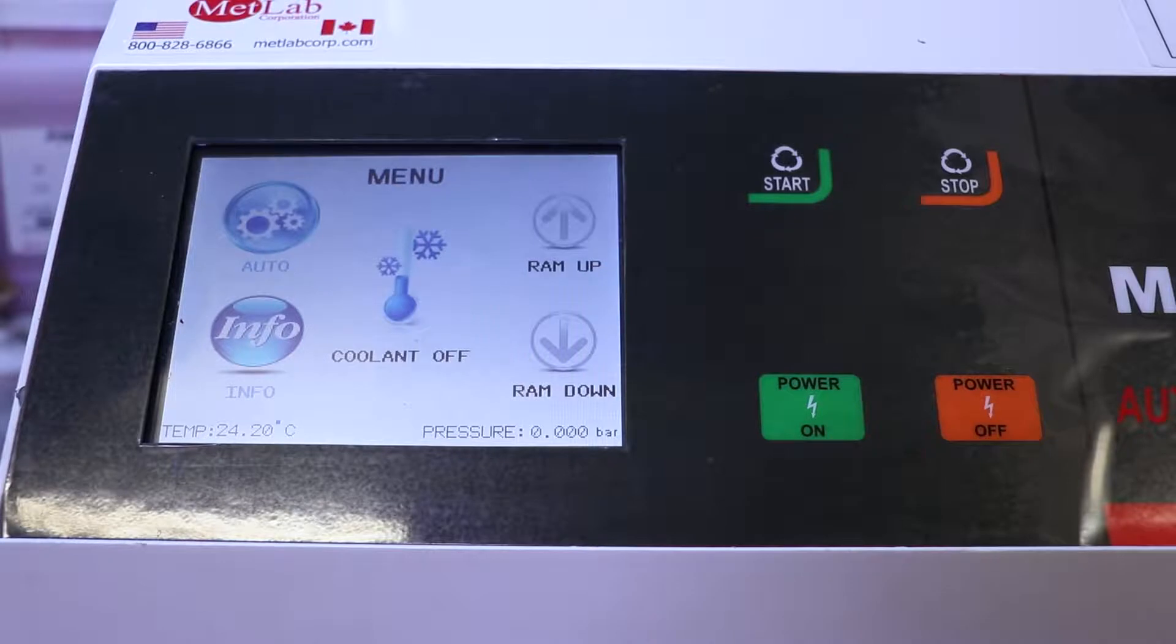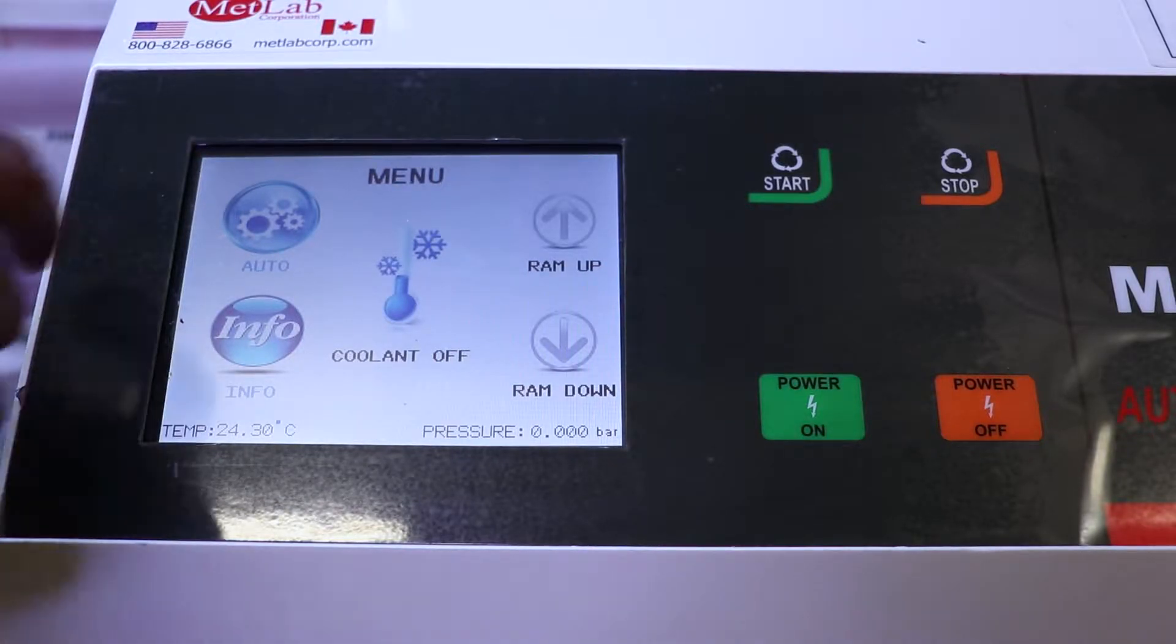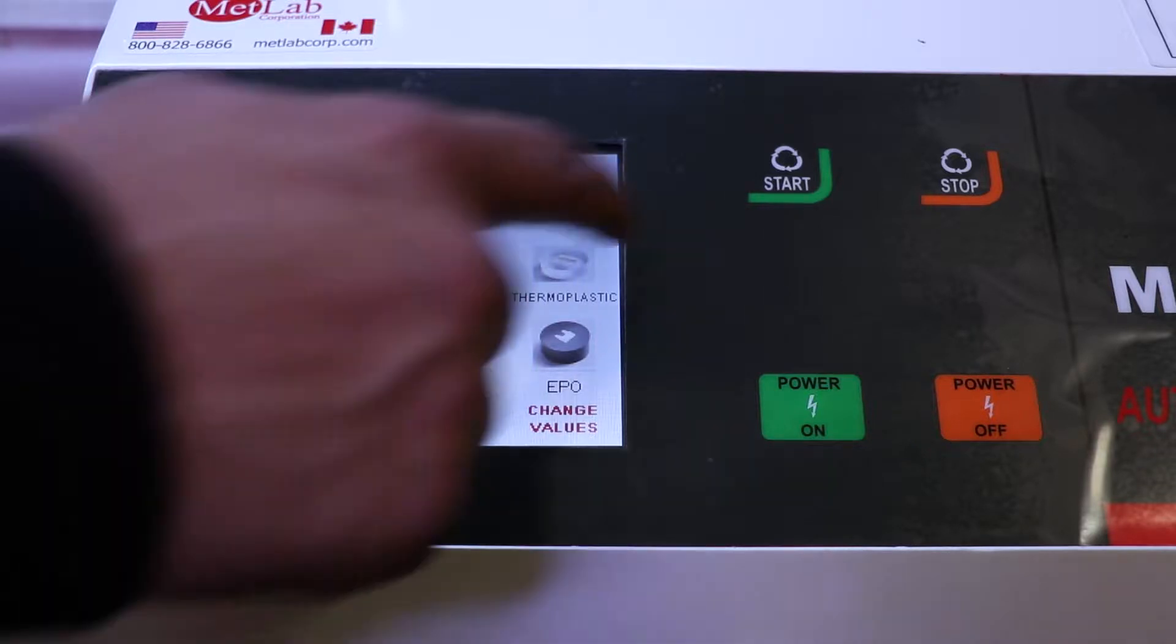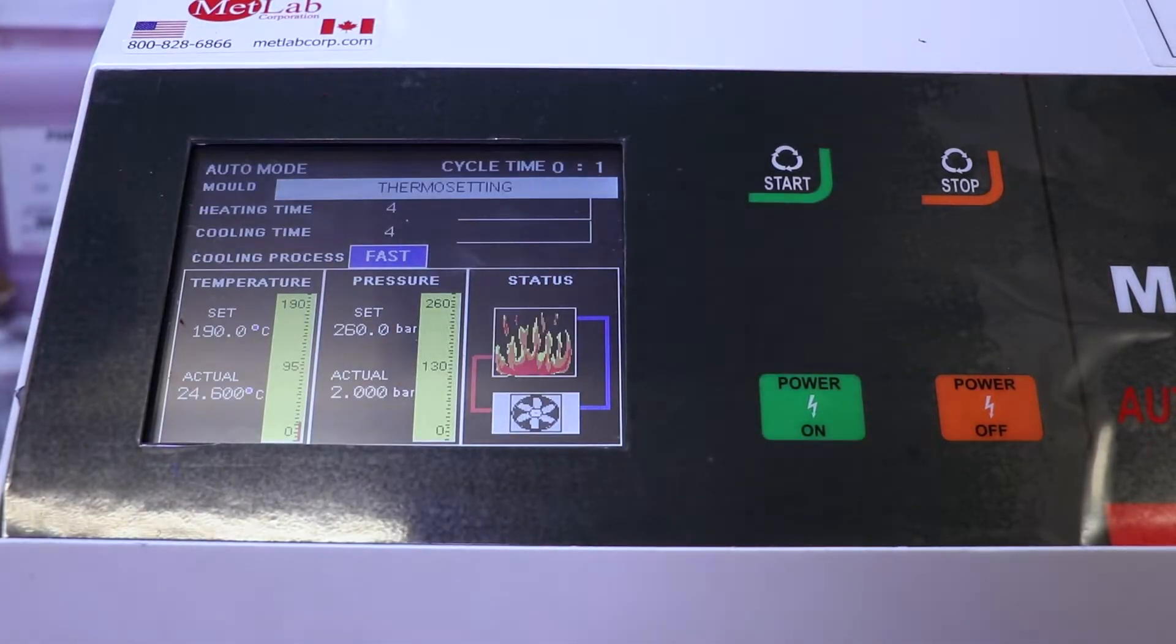Once you've got the lock down, you want to click on auto to just double check that all of your parameters are correct. And then you can click the start button and that will start the hot pressing process.